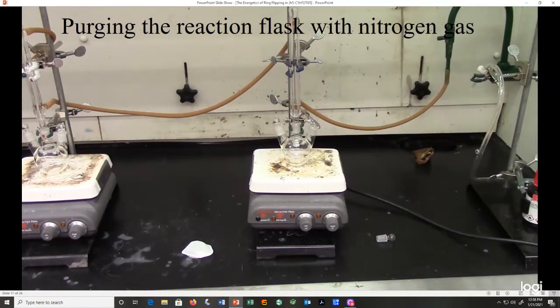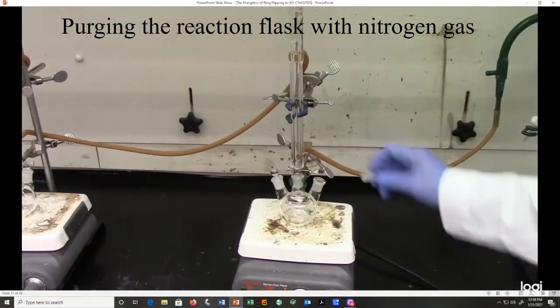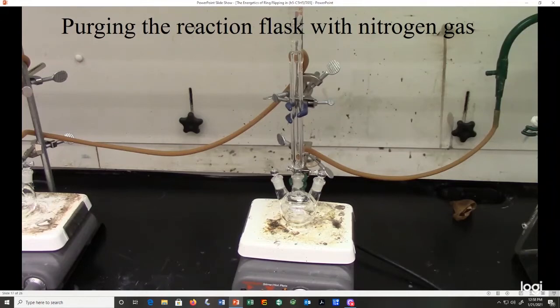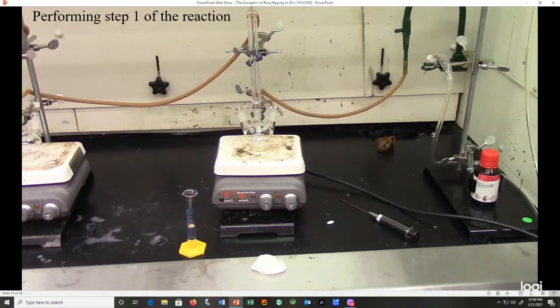If I take the glass stopper off of the reaction flask and look at the gas bubbler, I can see that the gas flow is now going through the reaction flask and not to the bubbler. So I'm going to leave that there for a while, and when I put the glass stopper back on, I can see that the flow of nitrogen is diverted back to the gas bubbler. So at this point, we're ready to perform step 1 of the reaction.